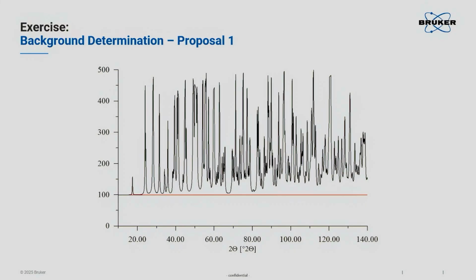Fortunately, in many applications, it's not so important if you touch it. So also indexing, for example, would come to mind, apart from the fact that you would use lower angle peaks anyway, but indexing is also not intensity critical. But structure determination is. Quantitative phase analysis obviously as well. Okay.